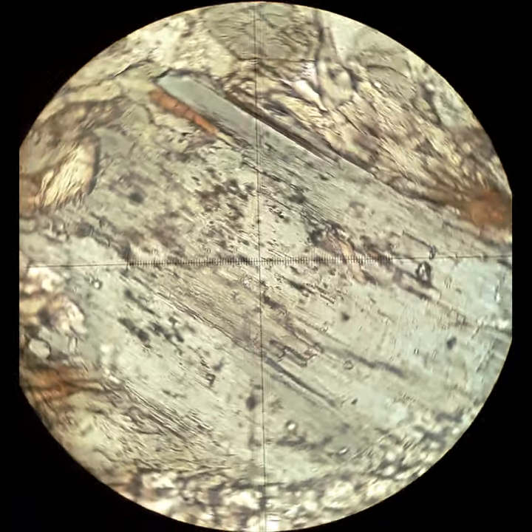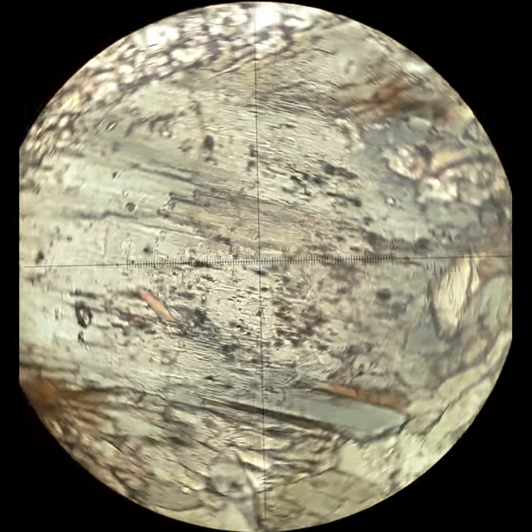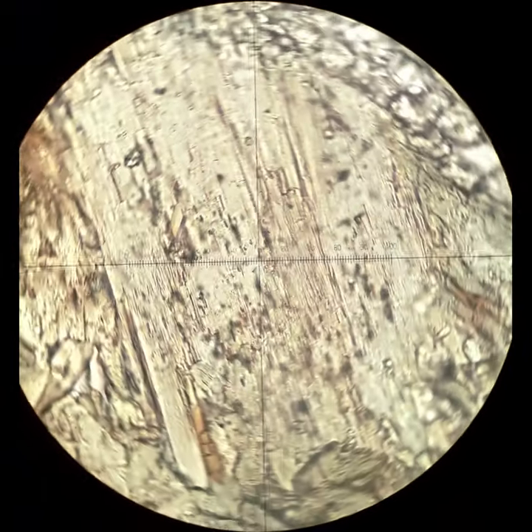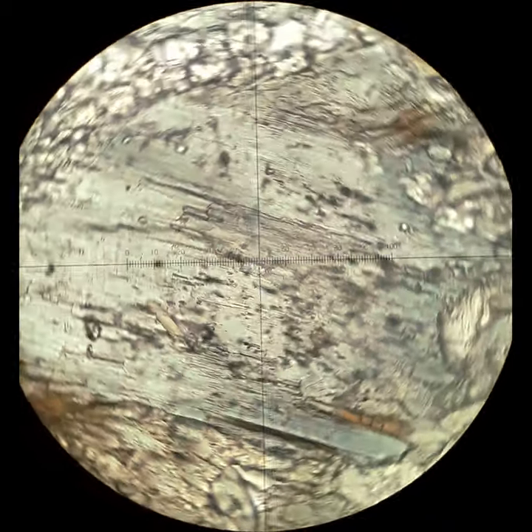Pleochroism can distinguish among different similar minerals. Here the cores of these minerals are very light-green pleochroic — those are actinolite. And then there's a darker green rim, which is hornblende.